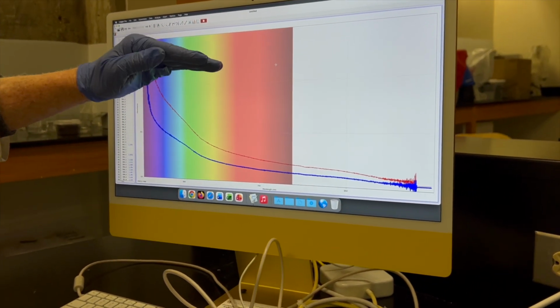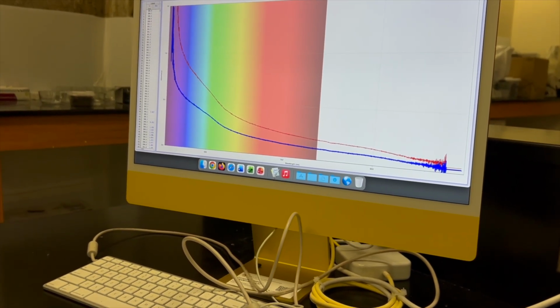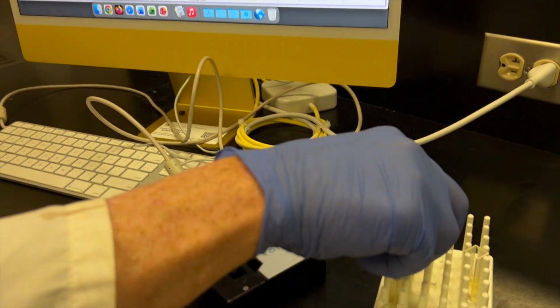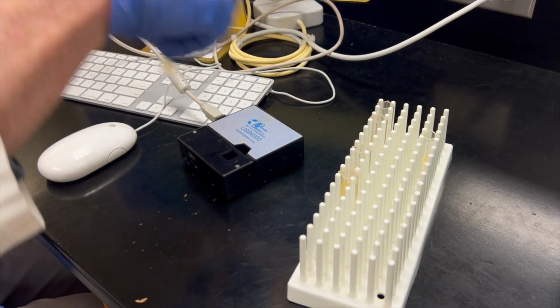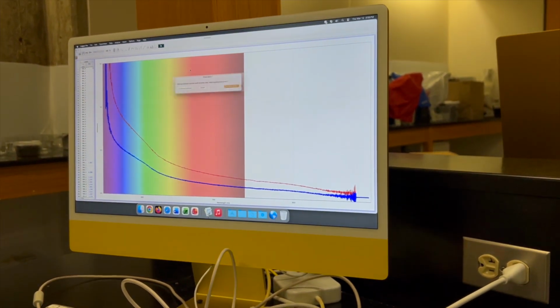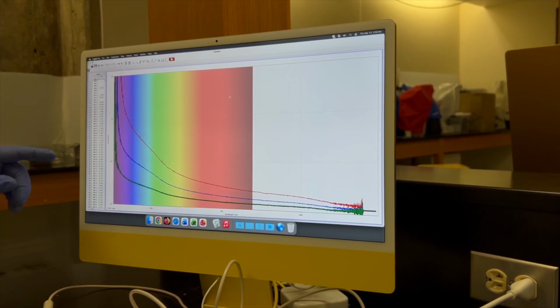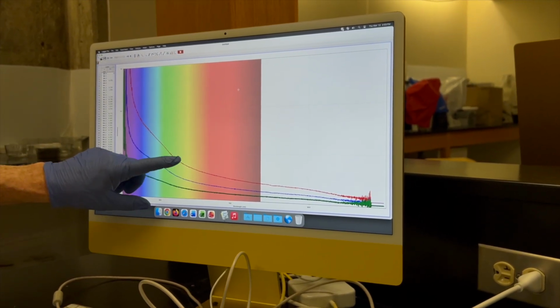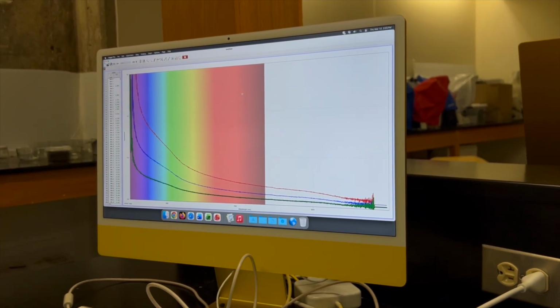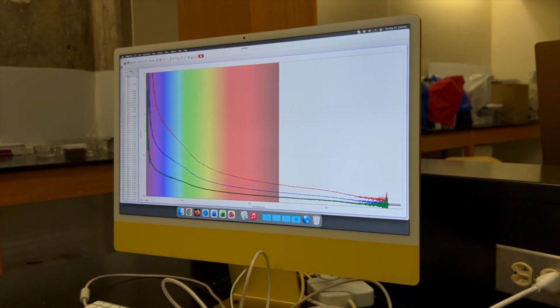The higher this number is, the more bacteria are in the sample. I'll hit stop. We'll then switch this out and put in our next one. Make sure that it's nice and clean. We'll hit play again. Store the latest run because it's fun. And we can see again it drops. So we went here to here. This dropped less than this because it's going to be a logarithmic function in there. And so it just continues to drop less and less.